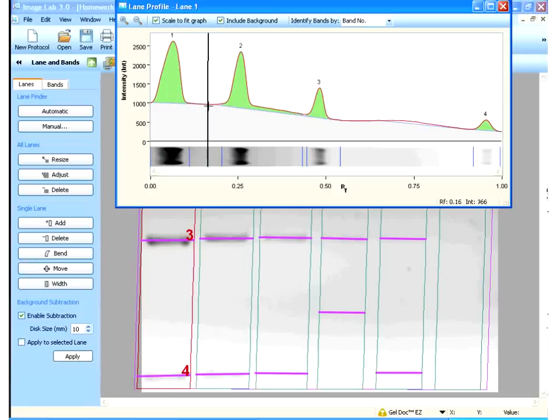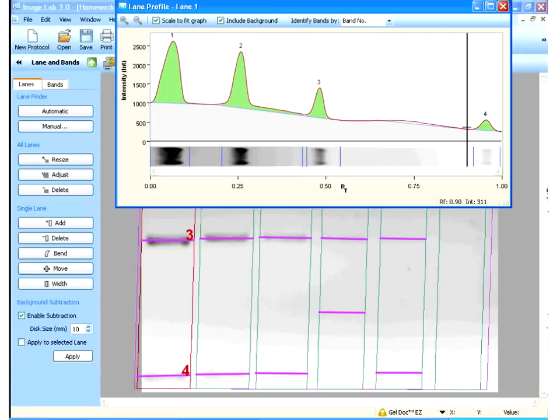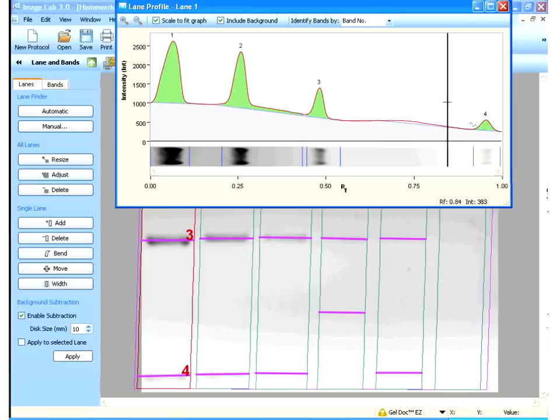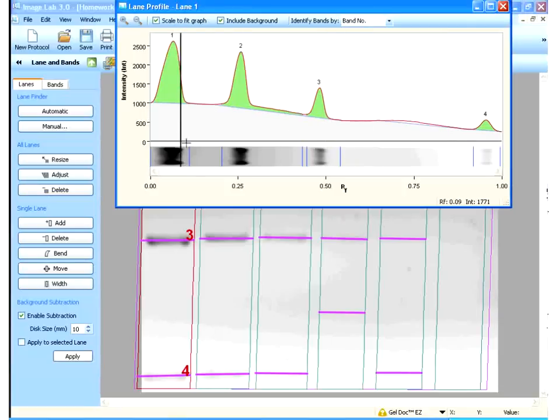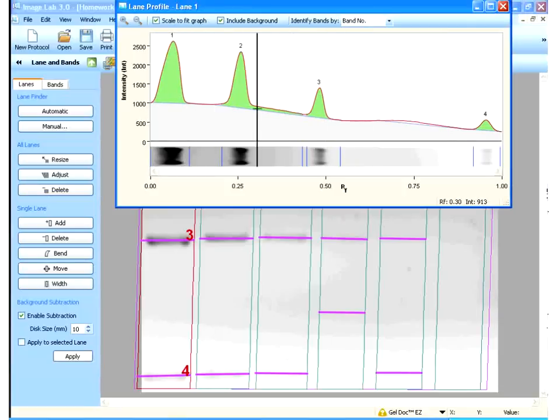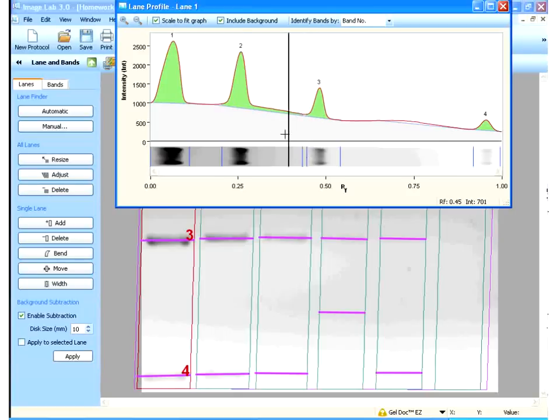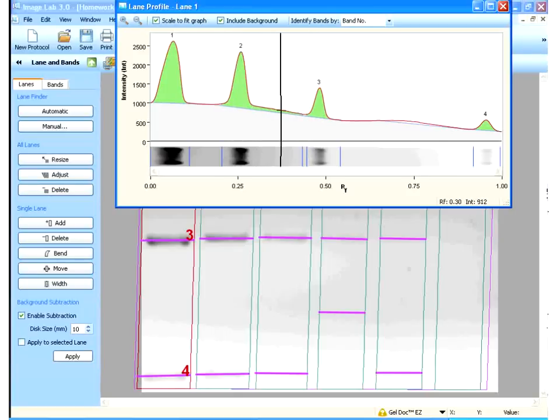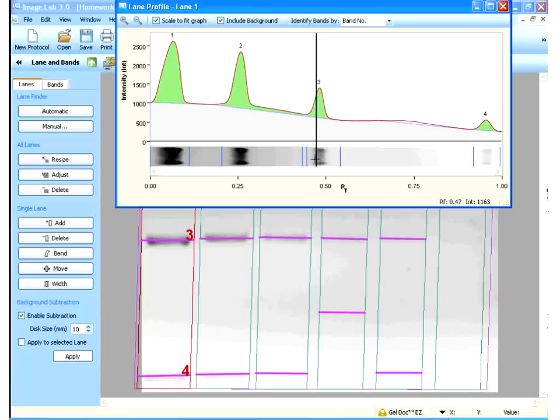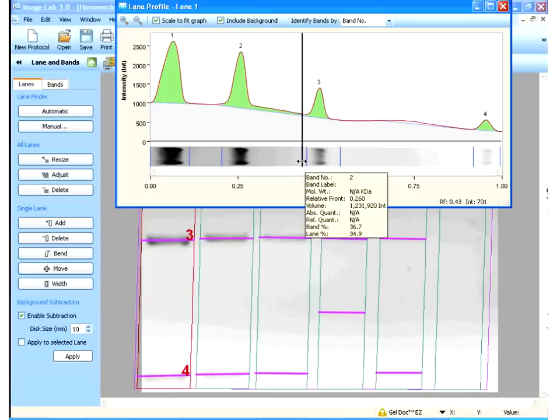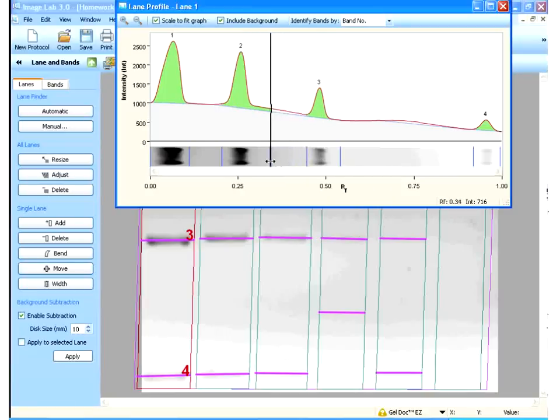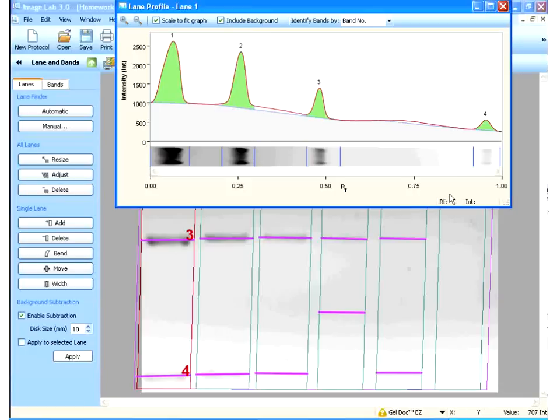And you can see it's done a really good job of cutting the peaks well, so I'm not taking background with the peaks, and I'll show you that in a minute. What I want to do is adjust the width, okay, because sometimes it doesn't do a great job. So, here in this case, you can see it's taken this peak plus all this little tail here. So, I'm going to move to where the tail ends, and I get these two arrows, and if I click and drag, I can drag back to the peak. So, I'm just looking at the peak.